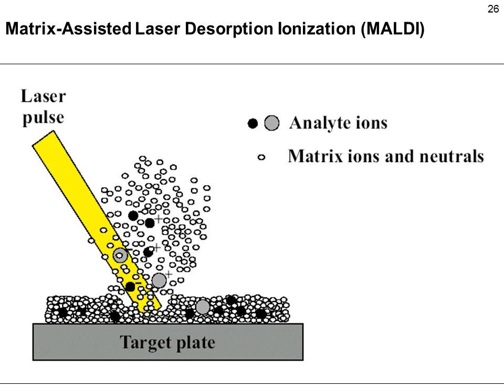This leads to kind of an explosion and a very hot plasma above the target plate. In this plasma, ions are generated through ionization directly through the light, but mainly through proton transfer from the matrix. Ions are then accelerated in a very strong electric field of about 20,000 volt into the time-of-flight mass analyzer, about which we will hear in a few moments.